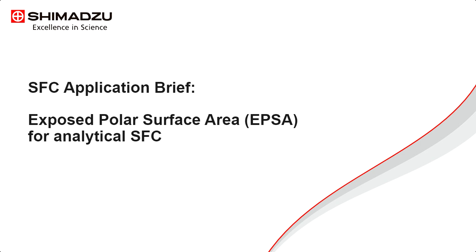So let's shift gears now from an extended case study of developing a method for peptides to an application brief where we look at the exposed polar surface area assay for analytical SFC.